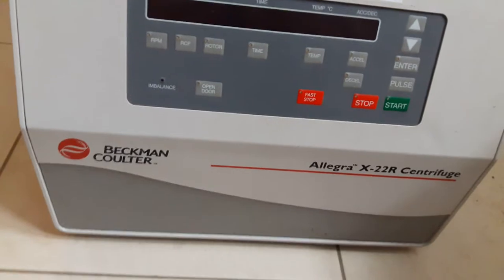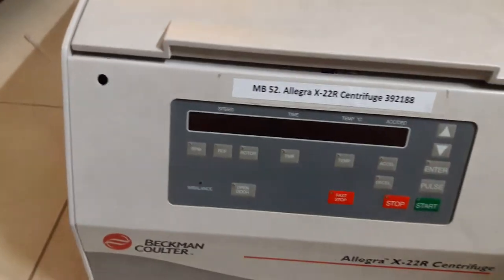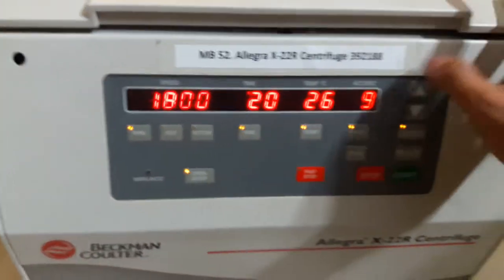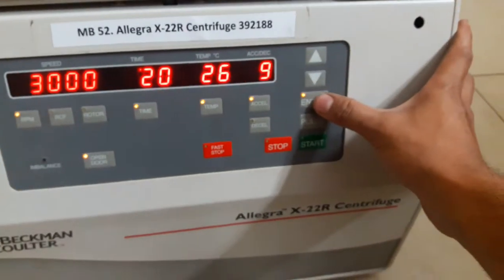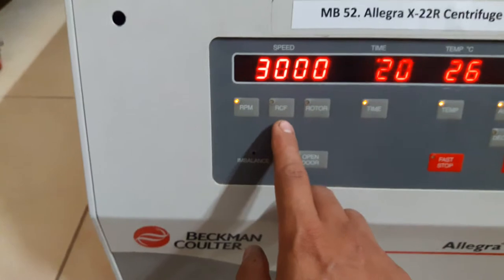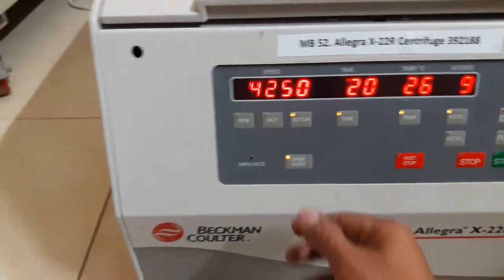We have the Beckman Allegra X-22R centrifuge here today, so I'm going to power it up. This button is for RPM — I press it to select the RPM I want. I have to press the enter button after selecting my desired RPM. This is RCF, and this one is for the selection of rotor.